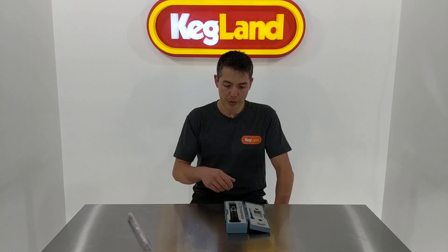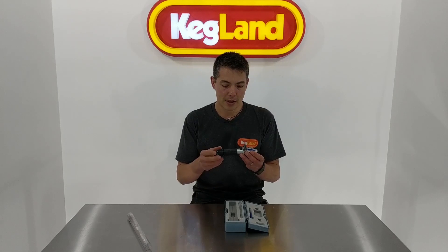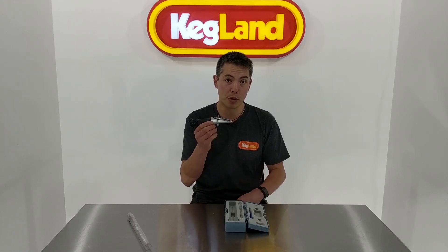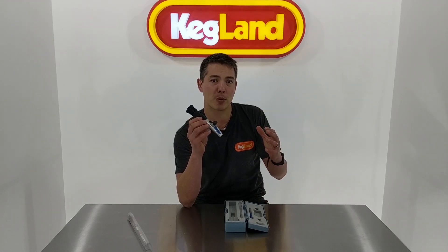However, with all-grain brewing, if you've graduated to all-grain brewing you might see the need for a refractometer. Refractometers take a sample which goes underneath this lens, and then depending on the angle at which they refract light, they can calculate that back into a gravity reading. A lot of home brewing refractometers have a lens with the gravity reading built in, which does that calculation for you. These are a fantastic tool in all-grain brewing, especially because you're trying to collect as much wort from your mash tun as possible, but you don't really want to go below about 1.010 on the concentration of sugars.